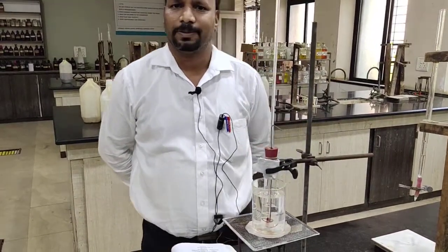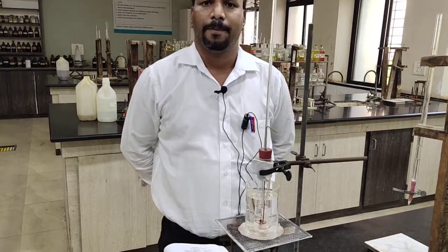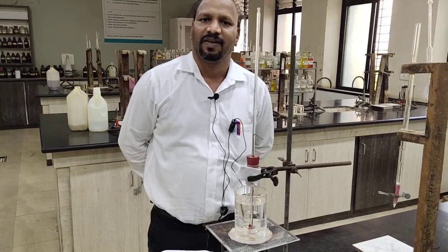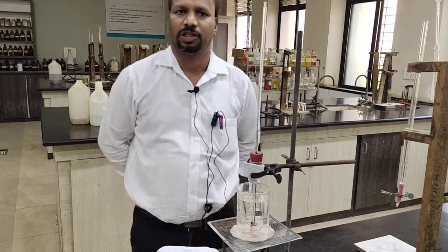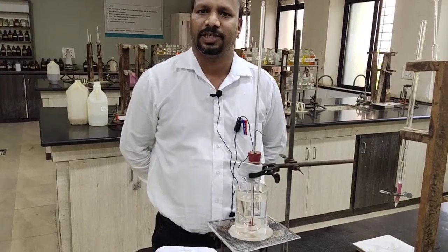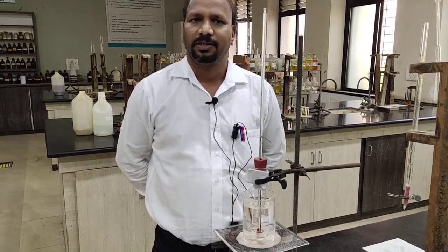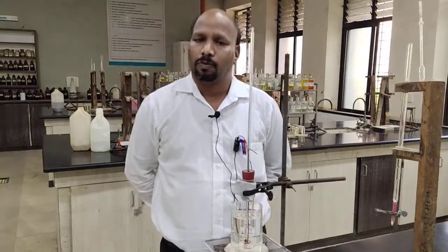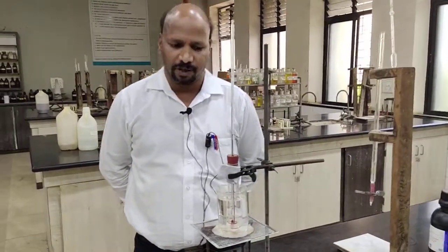In this experiment we have to study the second case, that is, the partially miscible system. The example of this system is the phenol water system. When phenol and water mix in each other, what will happen? It will form two layers, because this system is a partially miscible system. In the two layers, one layer is where phenol is saturated with water, and the other layer is where water is saturated with phenol.